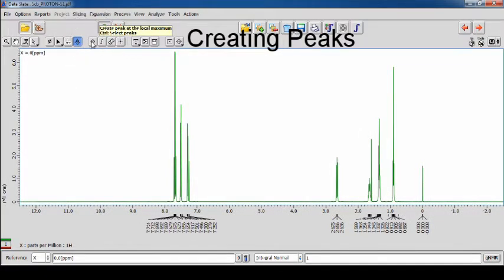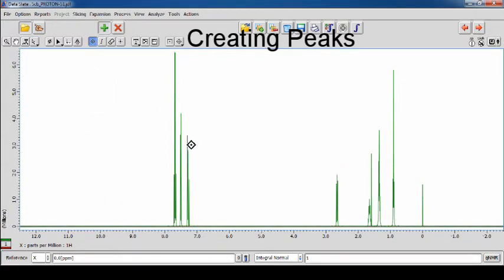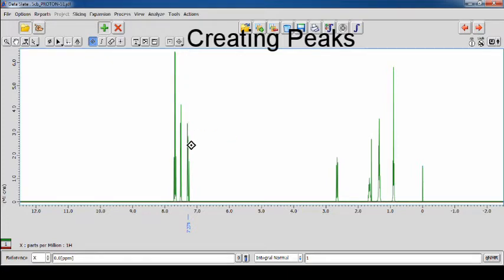Create Peak at local maximum allows you to manually pick peaks which exceed the noise and peak thresholds. The tool will mark only once for a set of peaks, unless you zoom in and mark each individual peak. Holding Alt will add specified peaks regardless of zoom. Holding Shift lets you place a peak anywhere, regardless of thresholds.